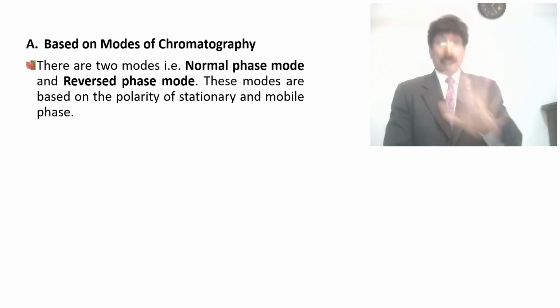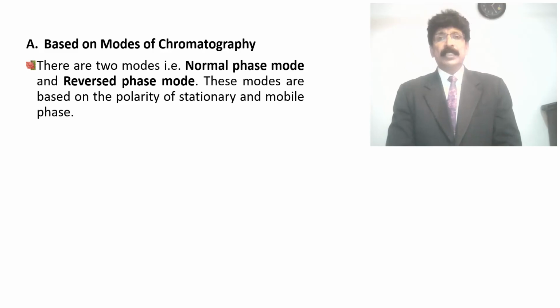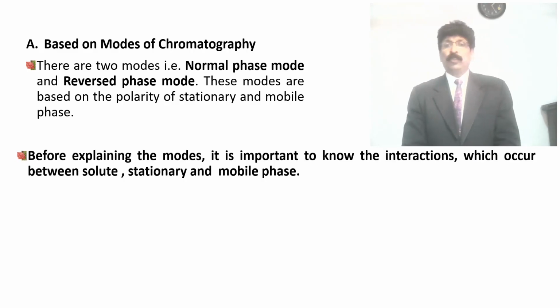The polarity characteristic of a solute, that means the sample, the mobile phase and the stationary phase play a major role in the separation. There are 2 modes, normal phase mode and reverse phase mode. These modes are based on the polarity of the stationary and mobile phases, and also the sample, the solute.